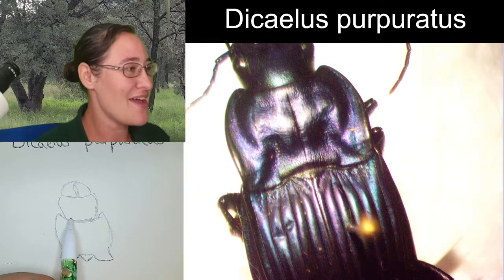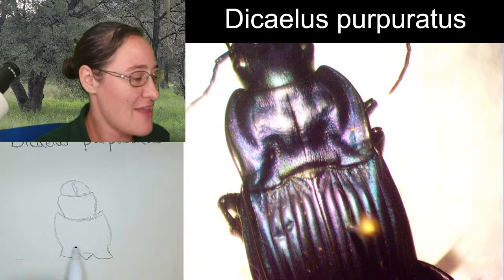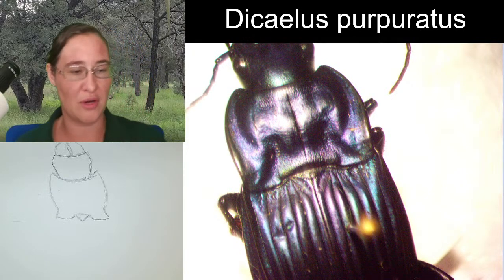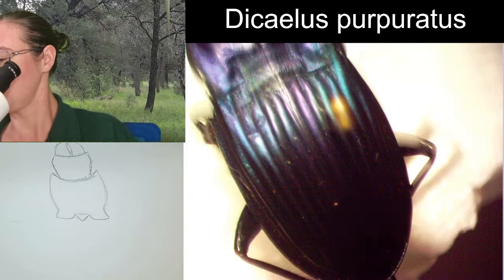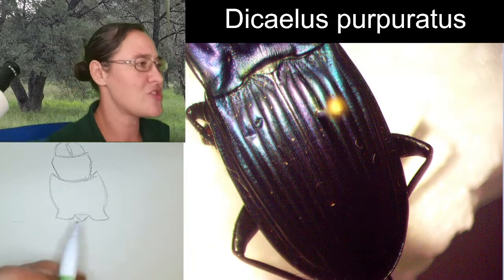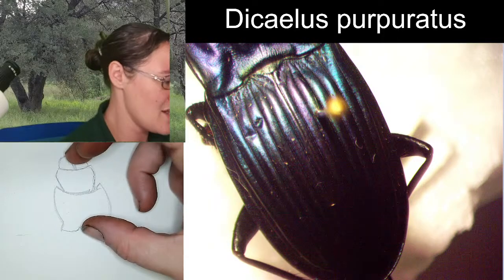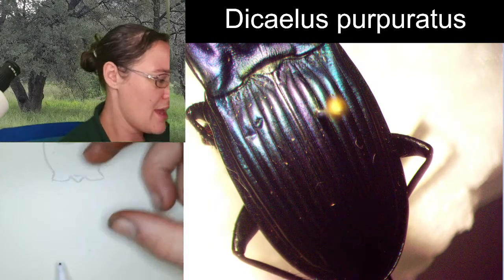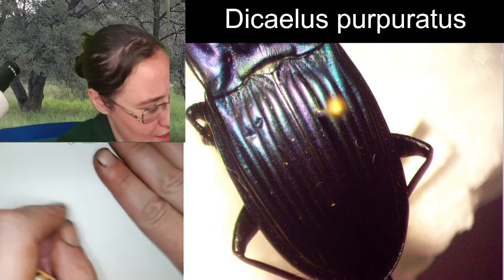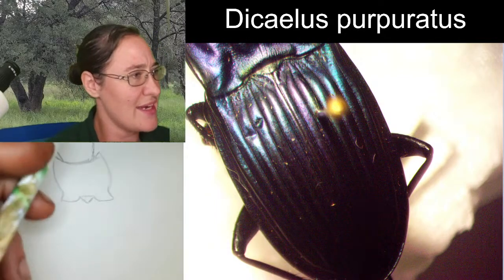All right, so we have this head. I did kind of start drawing it. We've got the head, the mandible, the pronotum. It's wide, and it flares out a little bit at the end. When we zoom in, we're going to see much more of these features. You probably heard me say that the elytra are about a time and a half the length of the head and the pronotum. So if I take this size here and push it down a little bit and then add essentially the length of the head, that's about as long as the elytra are. So I give myself a little notch here, and I'm going to give myself a really light outline of this shape.